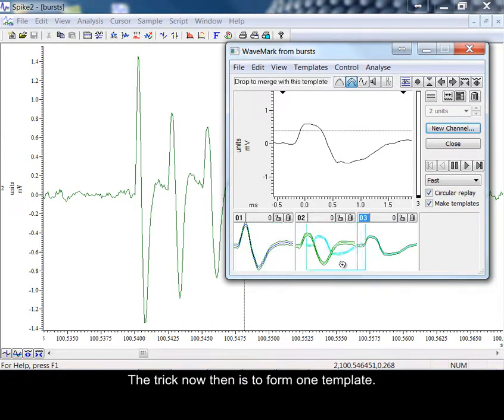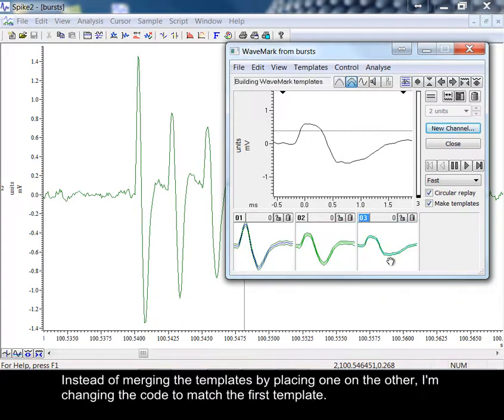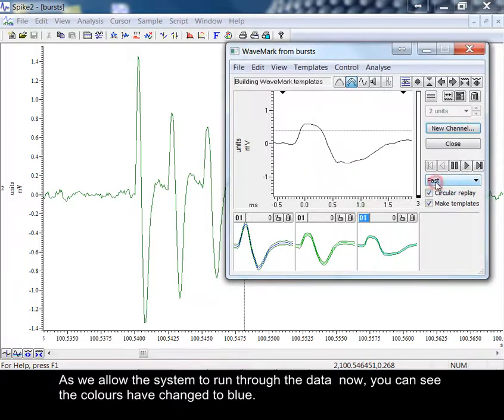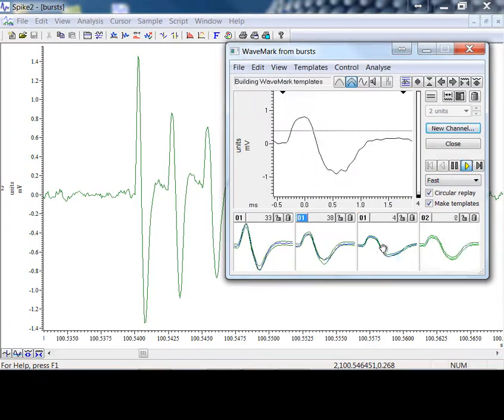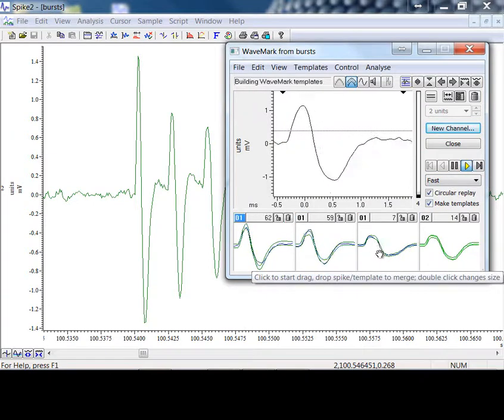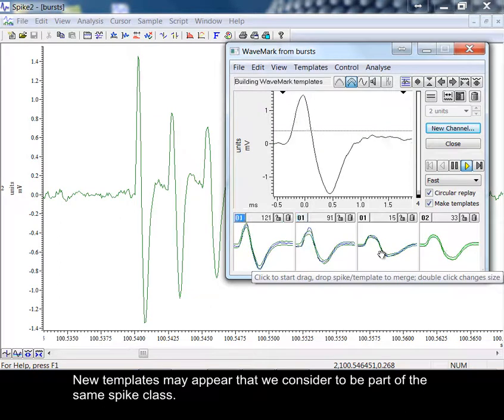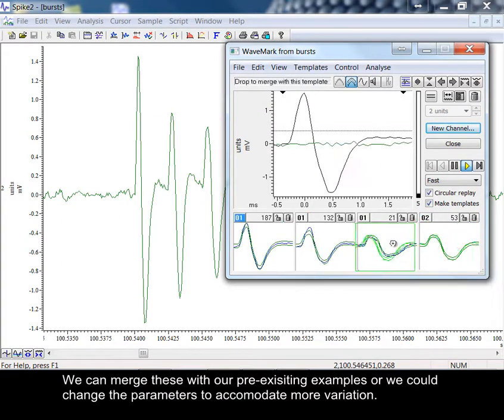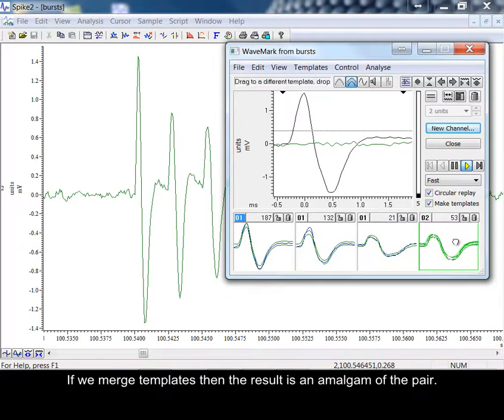The trick now then is to form one template. Instead of merging the templates by placing one on the other, I'm changing the code to match the first template. As we allow the system to run through the data now, you can see the colors have changed to blue. New templates may appear that we consider to be part of the same spike class. We can merge these with our pre-existing examples or we could change the parameters to accommodate more variation.